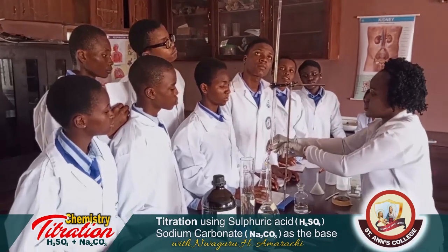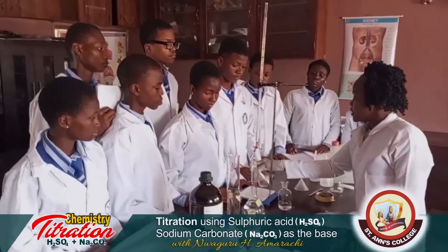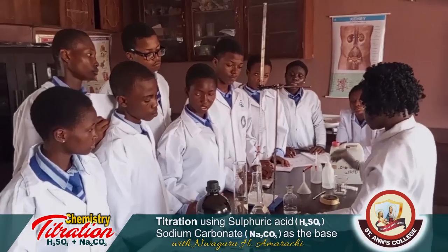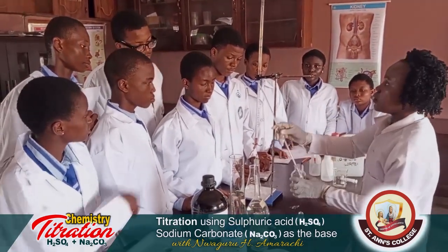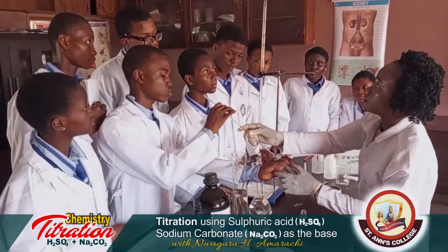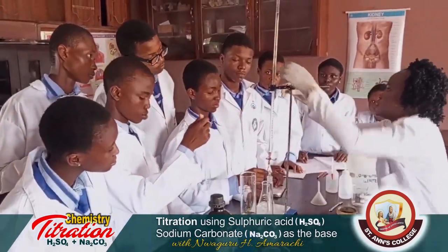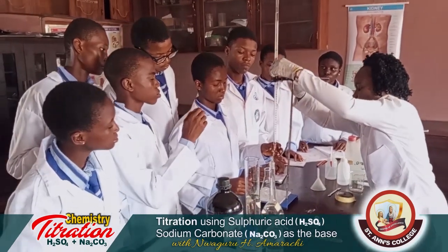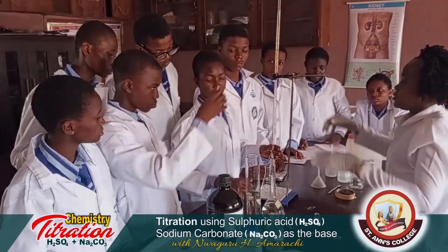Watch carefully. Then you discard. Let's get our base.